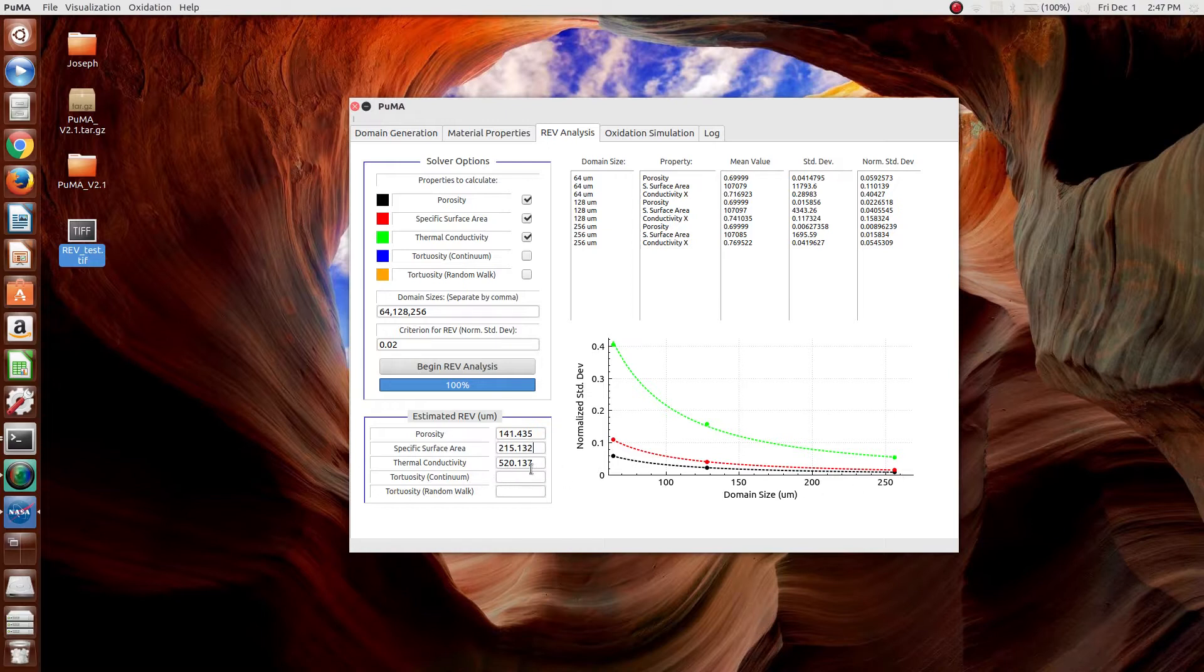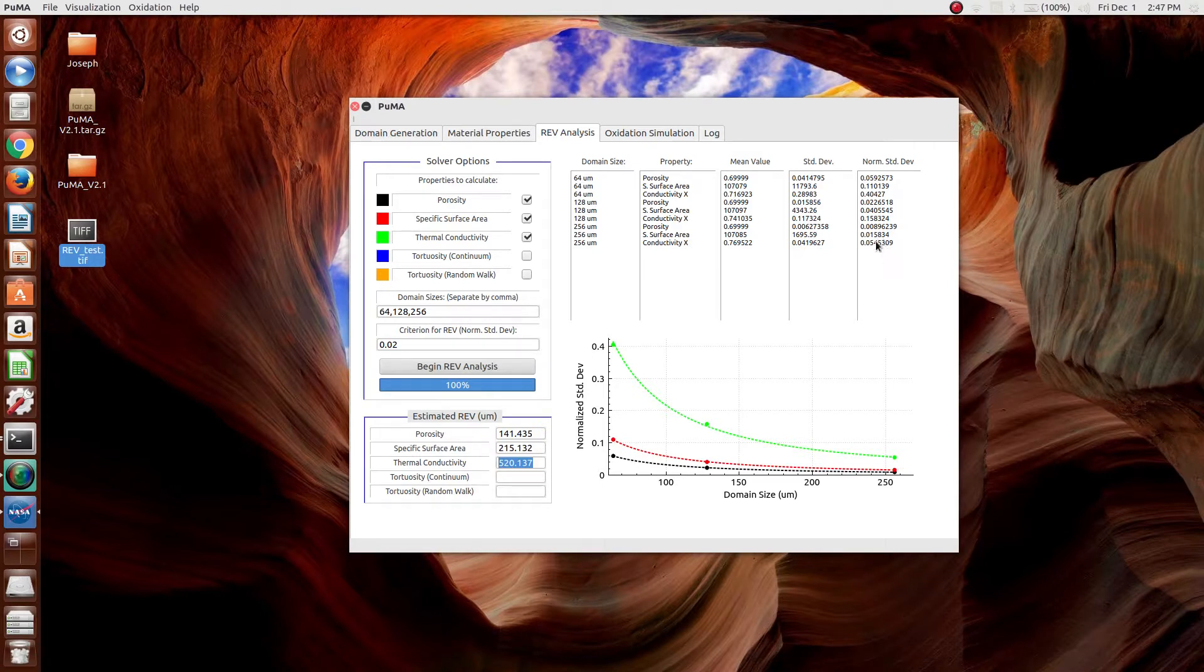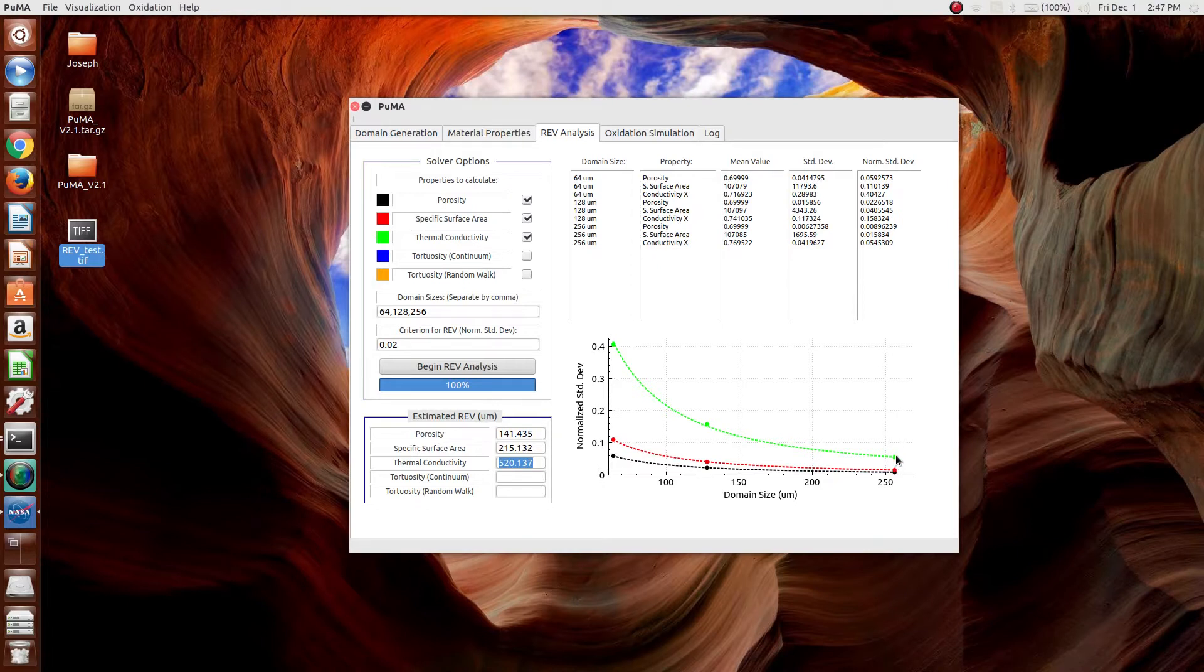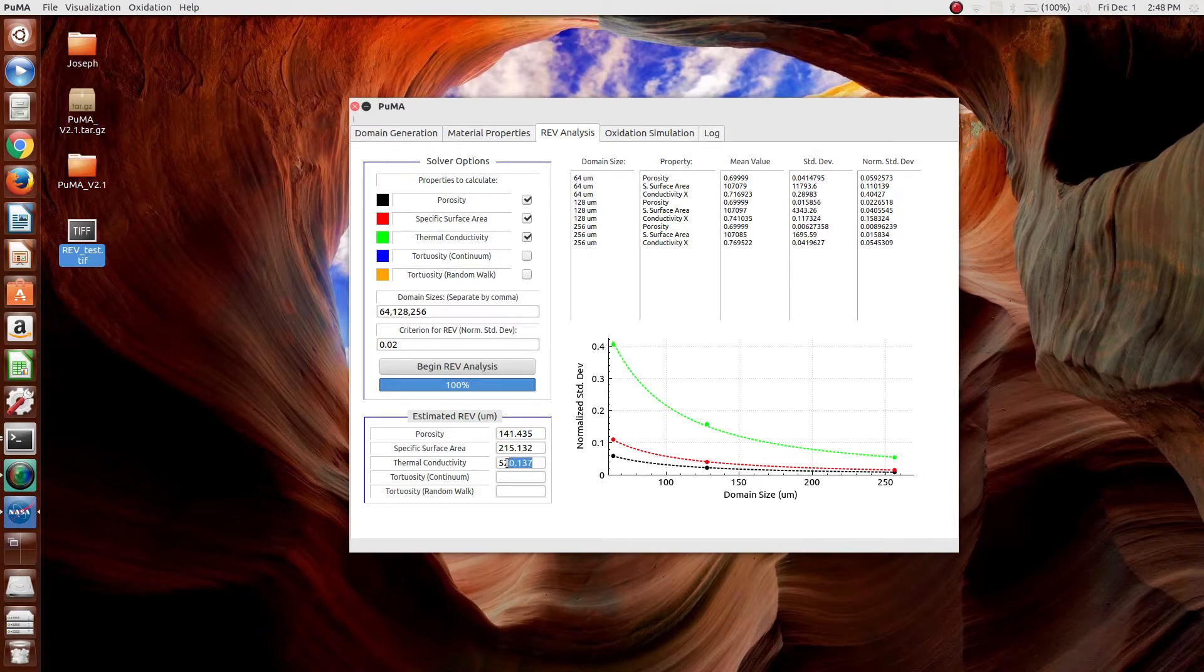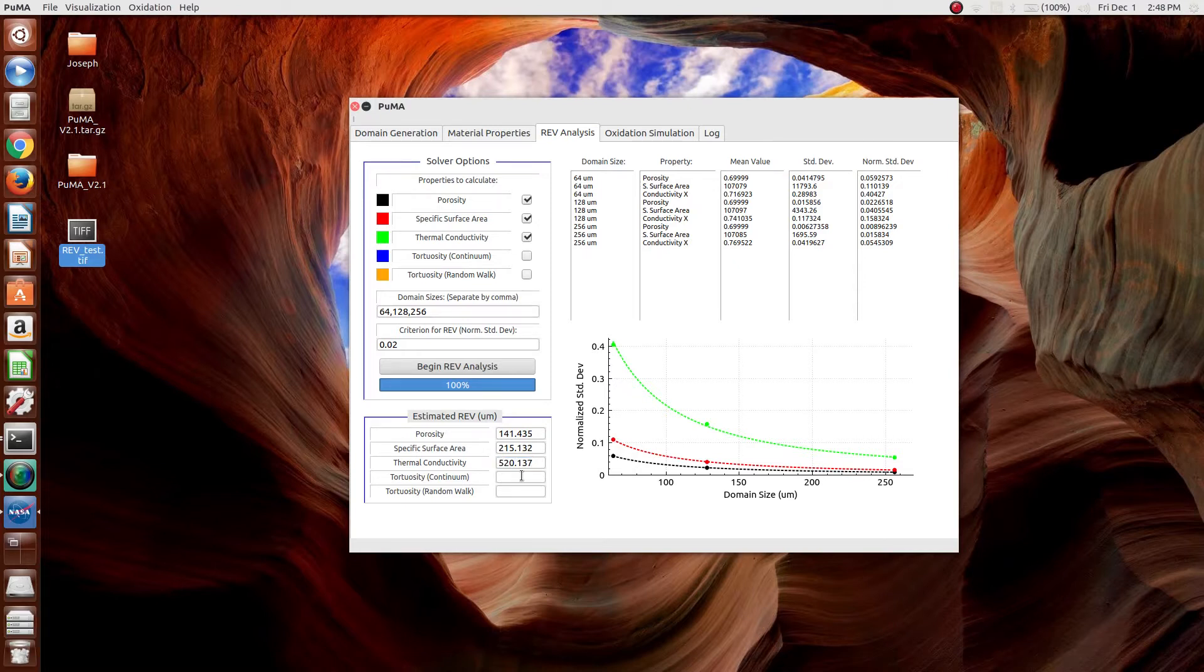And for the thermal conductivity, as you can see, the final value had a normalized standard deviation of about 5.4%. And what that means is that at 256 cubed for this material, there is about a 5.4% uncertainty or a 5.4% standard deviation in the computations. The value is then extrapolated based on a power law from these three points to have an approximate representative elementary volume of 520 cubed micrometers. However, since it's an extrapolation, it should be taken with a grain of salt.